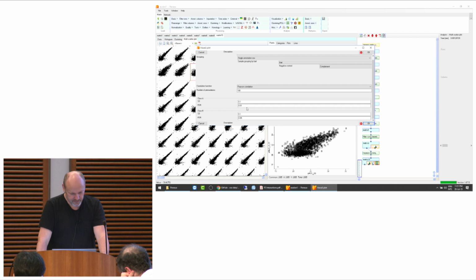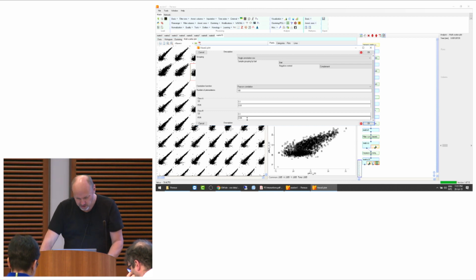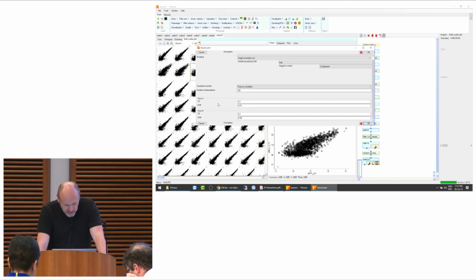and that's because we can define two classes of interactors. Like class A would be the clear interactors, so that would have like an FDR of 1%. And then you might want to still look at interactors or candidate interactors that are not so clear, right? And so you would use more loose criteria for this. So for example, 5% FDR, right? So with these settings here, class A would be 1% FDR, class B would be 5% FDR, and the S0 value we leave at 0.1.